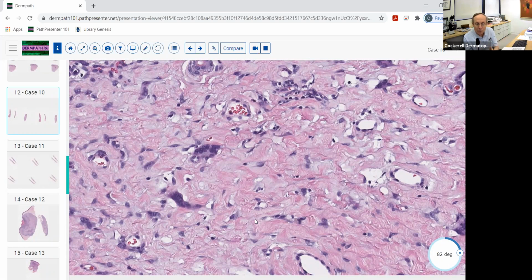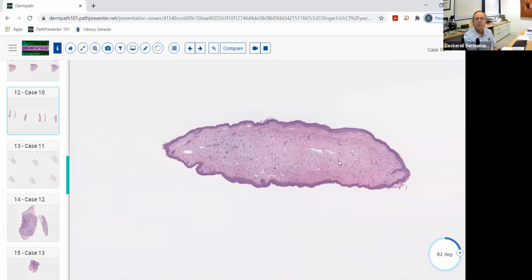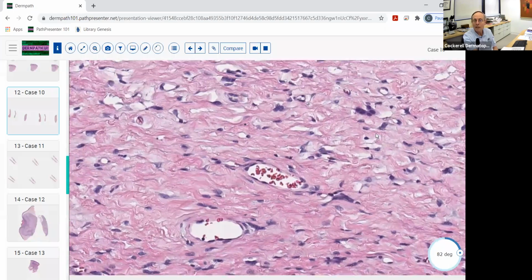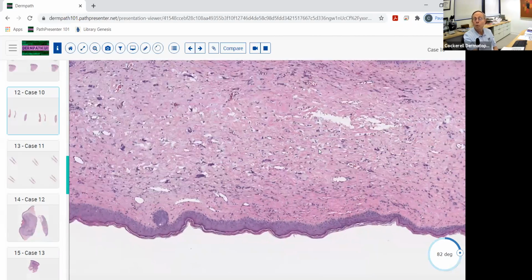It doesn't progress to cancer. Even the very atypical pleomorphic lipomas, they tend not to progress to cancer either. Rarely they can, but this almost never really does. This is just a benign histologic sort of gee whiz entity. And if you just look at a low magnification, it looks like a little benign sort of fibroma or maybe weird angiofibroma. You get a high magnification, say, whoa, it's got all these pleomorphic cells in here. So just realize that this is just a benign variant of one of the fibromas.